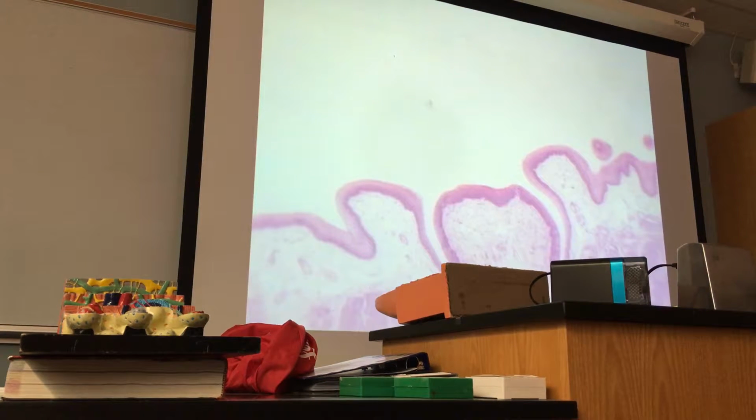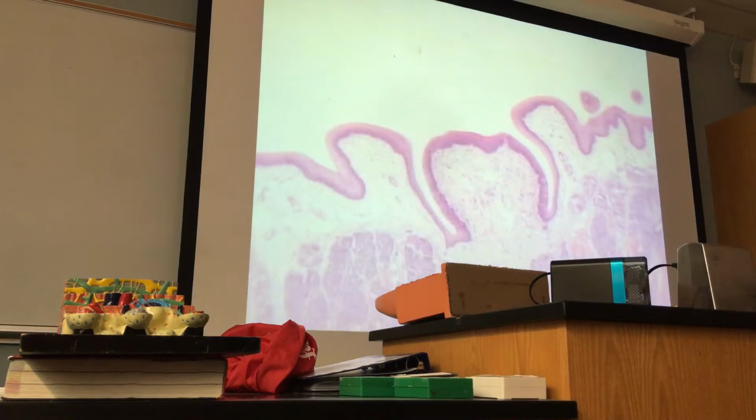Circumvallate papillae do not have keratinized stratified epithelium, just non-keratinized stratified epithelium, like smooth. Can you see that? This is smooth, and this is the groove here, and this papilla has taste buds on the border. The taste buds will be evident under higher magnification.